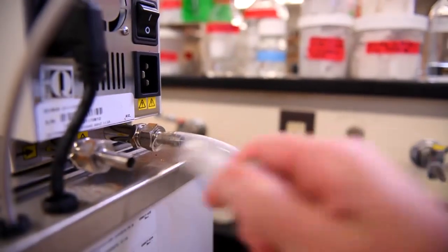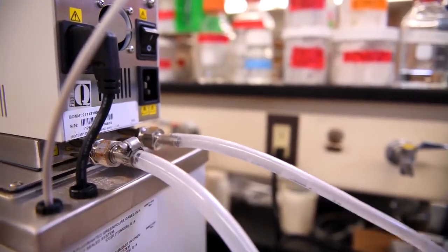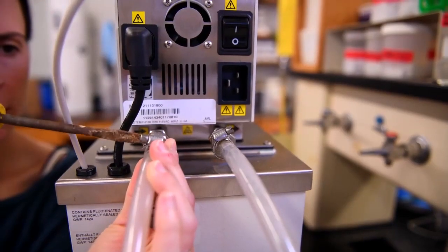Attach the heat exchanging coil to the external supply and return fittings of the circulating water bath. Ensure the connection is secure using hose clamps.